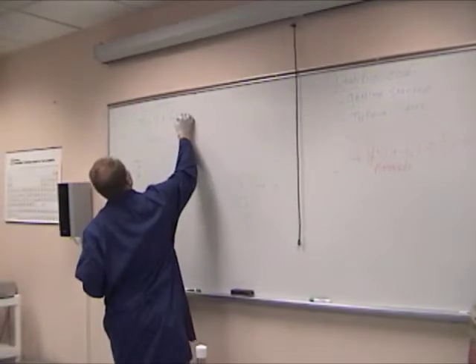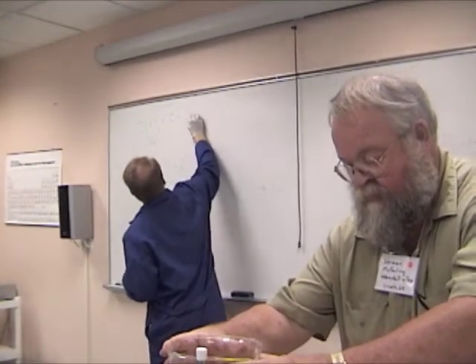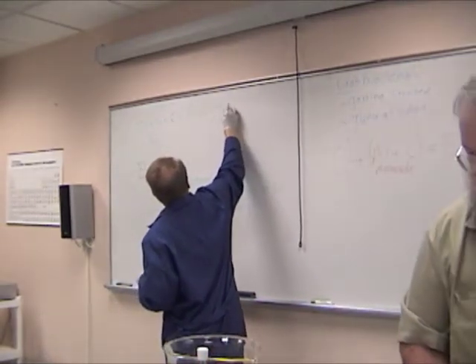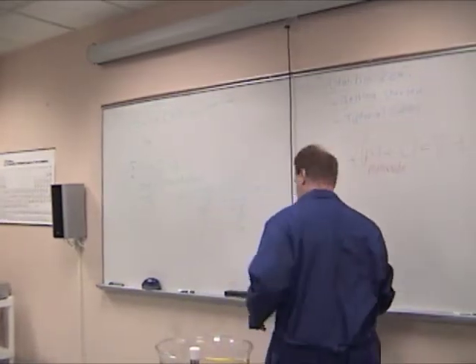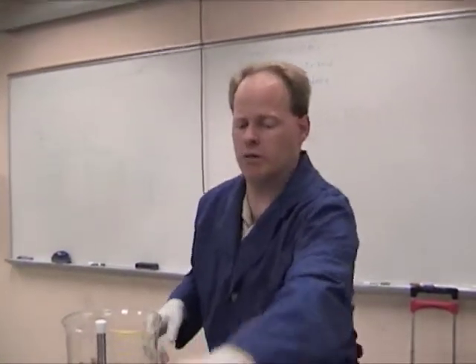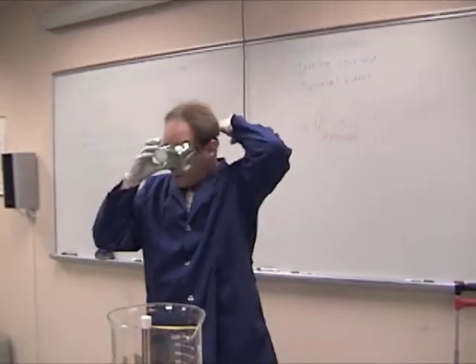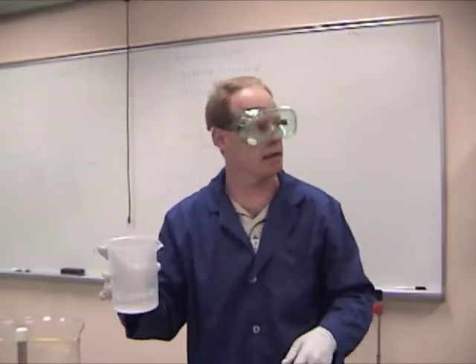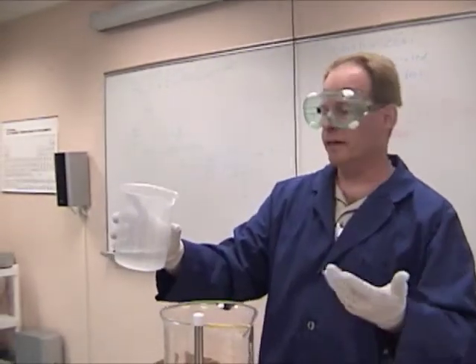So this is new oil that we're playing with. We're probably going to get biodiesel and some glycerin and maybe a little bit of water, maybe a little bit of soap. Okay. This, based on our recipe, is about 100 degrees Fahrenheit. This is about 135. Did we take it up that hot? Yeah. Okay, good.